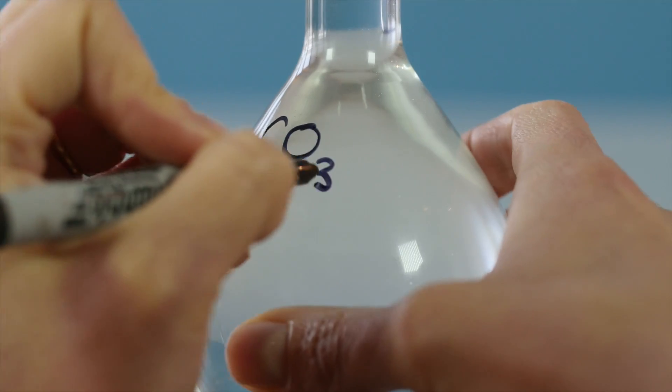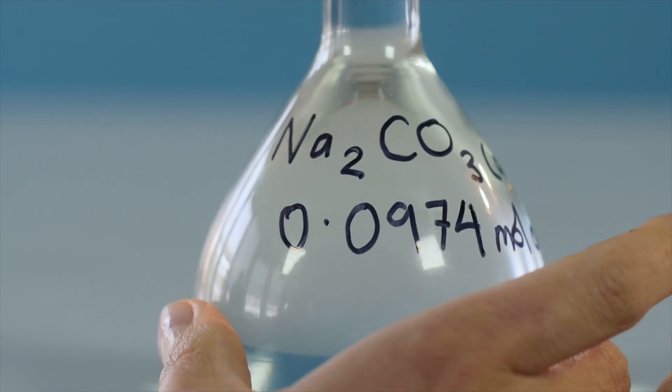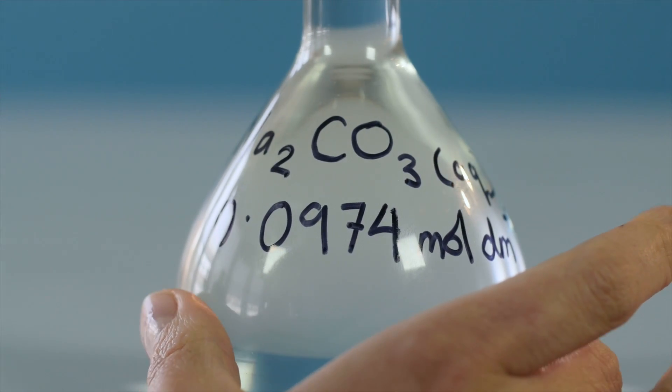To make sure the concentration of anhydrous sodium carbonate is the same throughout your solution, stopper the flask and gently invert it several times. Finally, you will need to label the flask clearly, including the exact concentration of your solution.